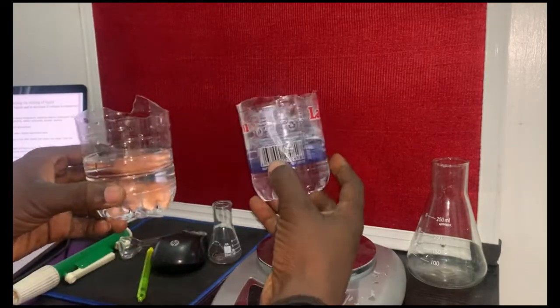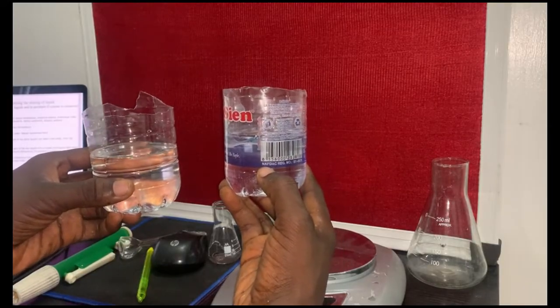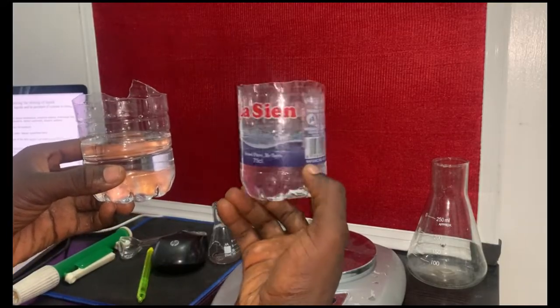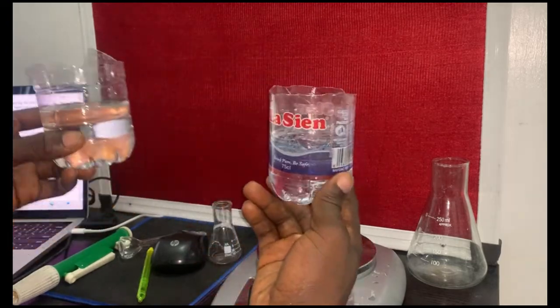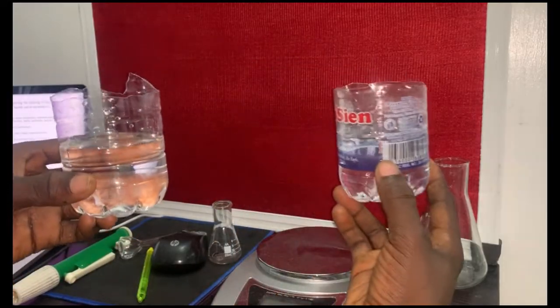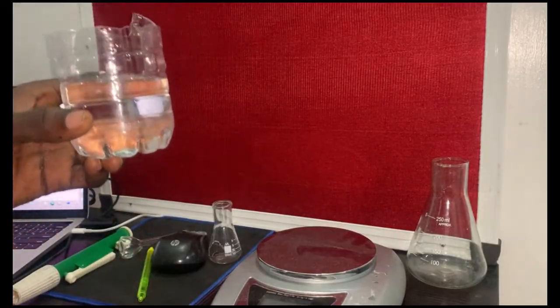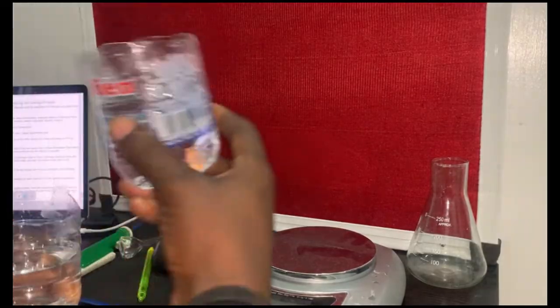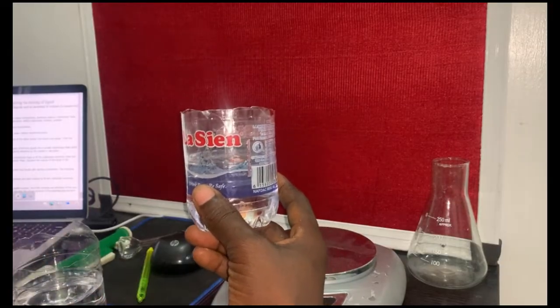If you notice, the texture of both of them is almost the same, the color is the same, they are colorless to start with, but I had to use this label to demarcate the ethanol from the water to avoid making mistakes. So this is my ethanol, sample B, and this is my water, sample A. Anytime I say sample A, I'm referring to water. Anytime I say sample B, I'm referring to alcohol, or ethanol precisely.